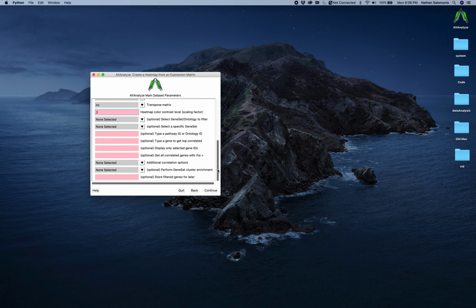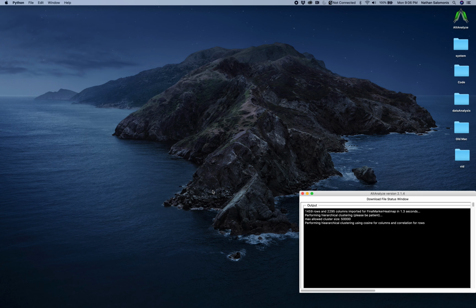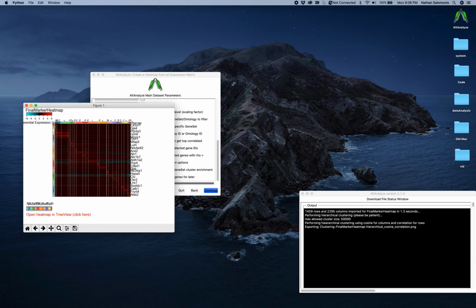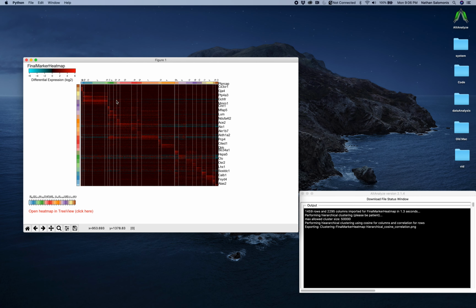And there's a number of other options here too. So we're just going to select that and see what that looks like. There's a number of different color options there that you can play with. Importantly, in this case, there are some groups that are already designated in this file already. You can see how those options changed.